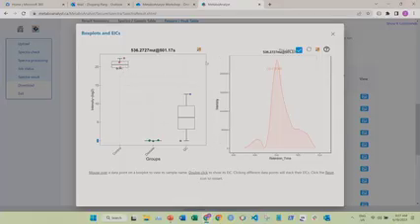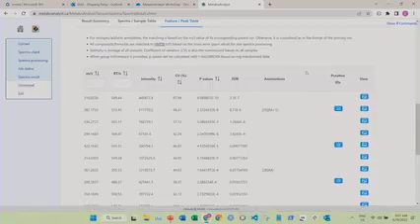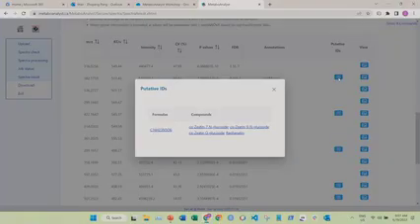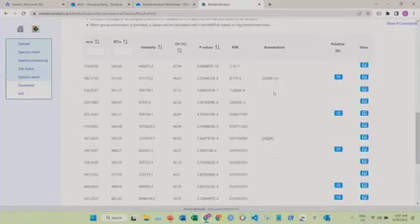node directly. It's going to plot the EIC for this feature directly from the different samples. As you can see, this is the one from this one. The blue one is from here. They can interactively generate for your manuscript or whatever. So here also the potential chemical IDs can also be provided. Here you can see the potential chemical identities from here.